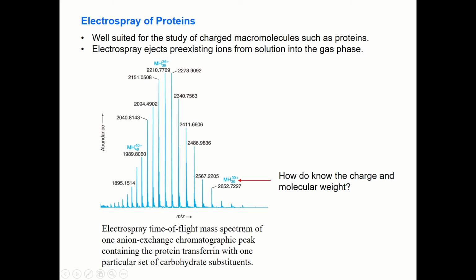As you see, the molecular mass is very big, so electrospray is a good technique for studying proteins. Another technique is MALDI-TOF, which you'll see soon.